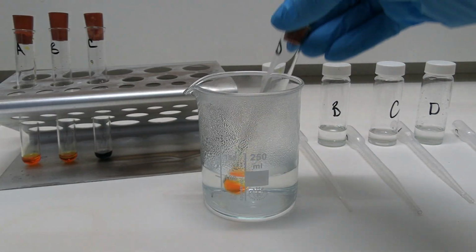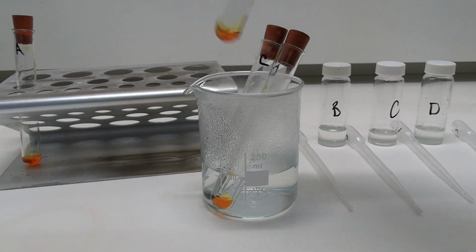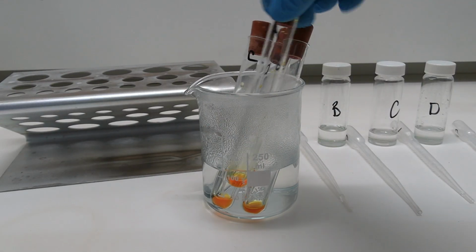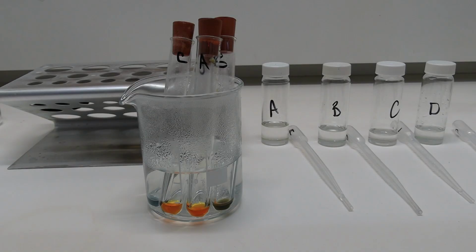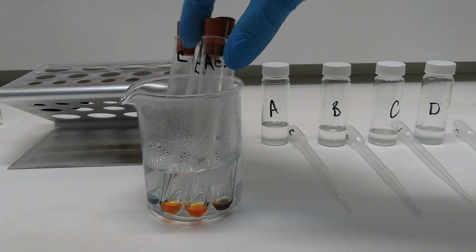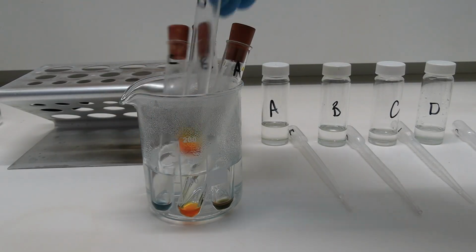Place the test tubes in your water bath and leave them for 2 minutes. Once the time is over, give each test tube a gentle shake, dry it with some tissue, return it to your test tube rack, and record your observations.